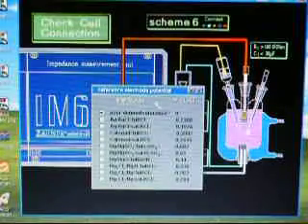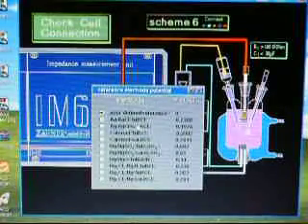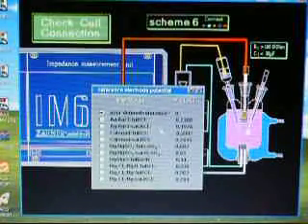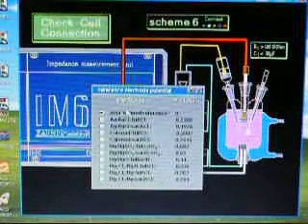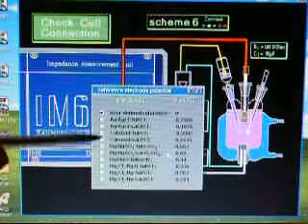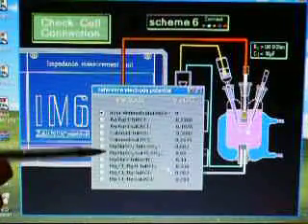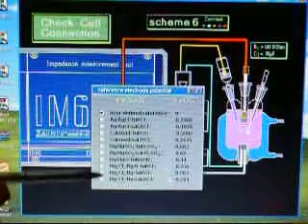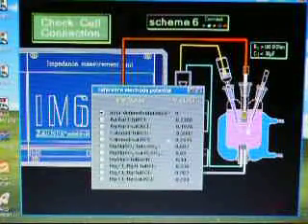We can also establish which reference electrode we're using — either user-defined or any of the silver/silver chloride, calomel, mercury sulfate, and so on.